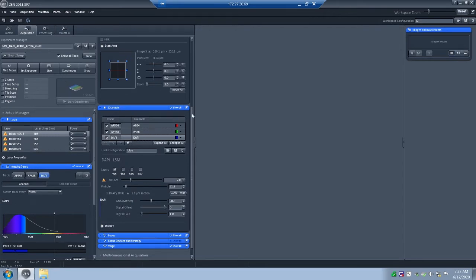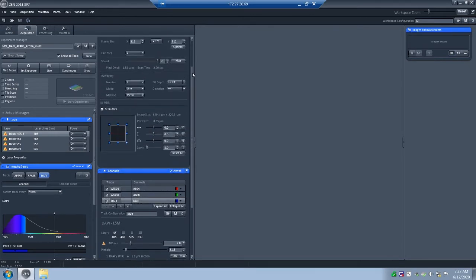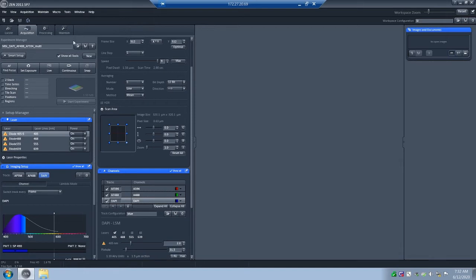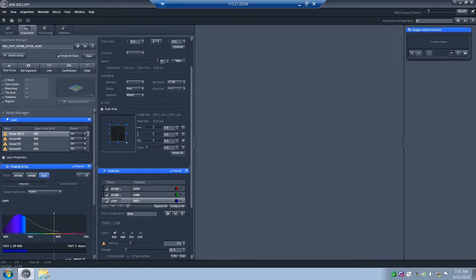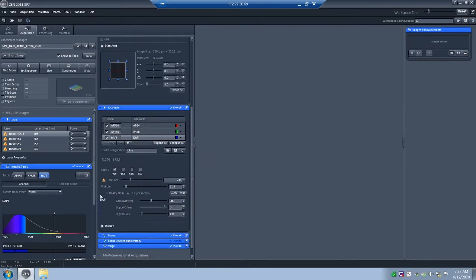We have the settings loaded. Next is the pinhole size. If you forget, on the desktop you can find a workflow to follow. The first thing we did was load imaging settings from the MSL list or a previous image — you can also load settings from an image you've already taken, which is typically the more practical approach. Since we don't have a previous image yet, we loaded from the default list. So let's talk about how to set the pinhole size.